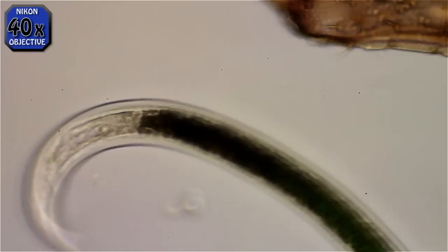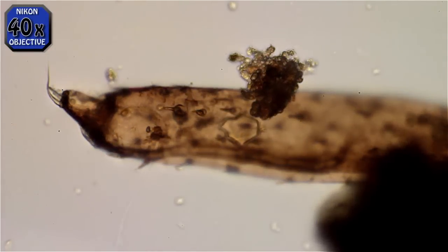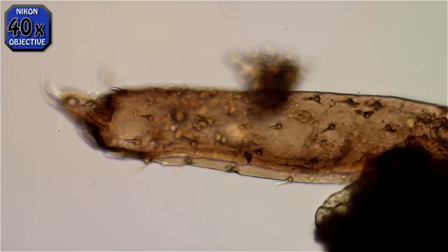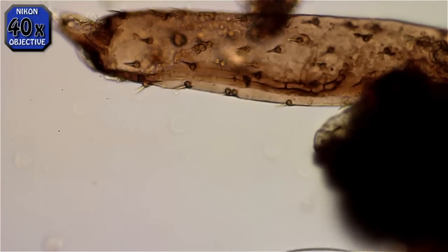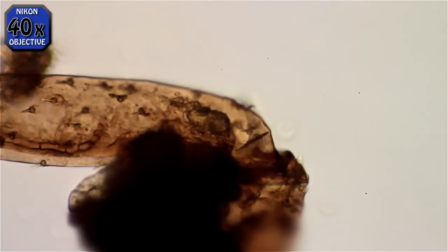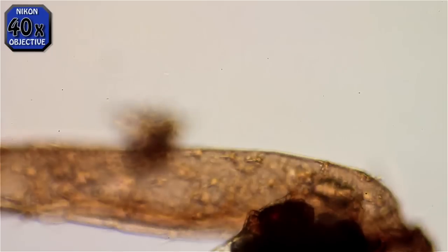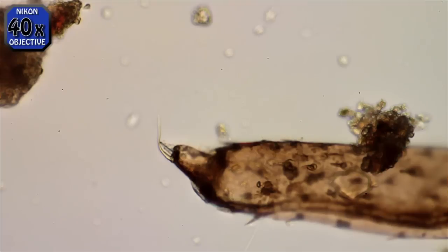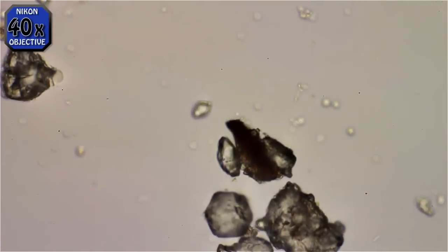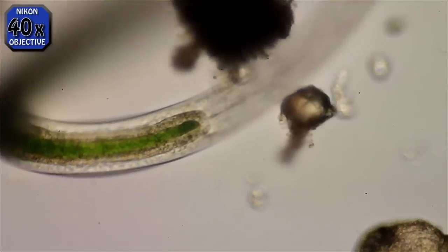This view is magnified approximately 400 times. I got sidetracked while recording — here you can see an insect leg. There's the foot at the left, hair follicles on the leg, and a joint where you can see it was ripped off. This is no doubt some decaying matter. Now, back to the worm.